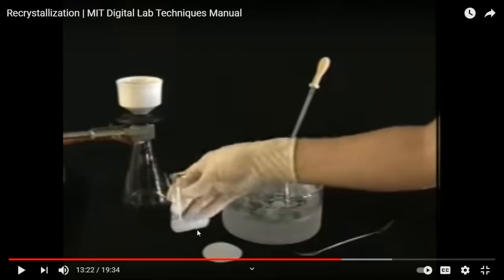Okay, so you do it quickly and you use vacuum properly and run vacuum first, have the vacuum ready to run and suck it out, right? Then you pour everything quickly and minimize time for liquid staying here. As you add additional liquid, don't do it when you have liquid remaining there.